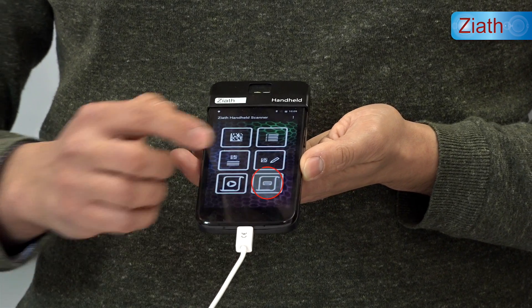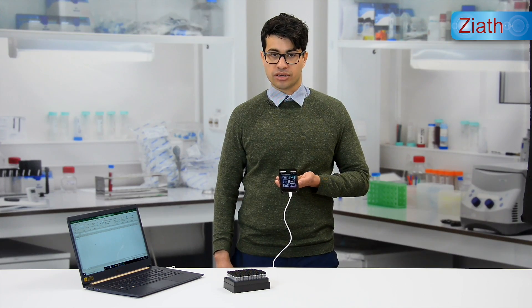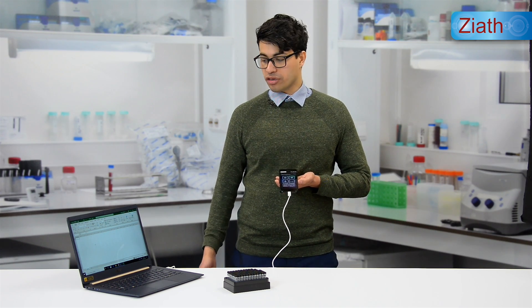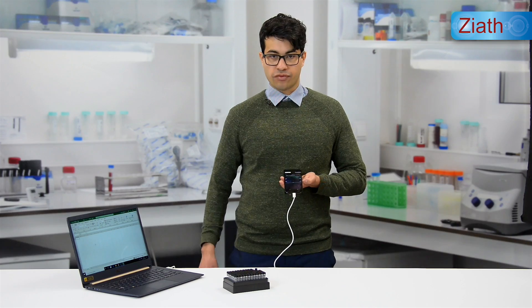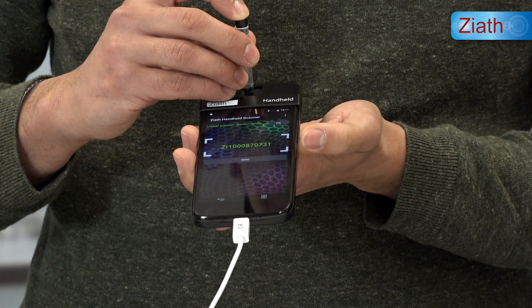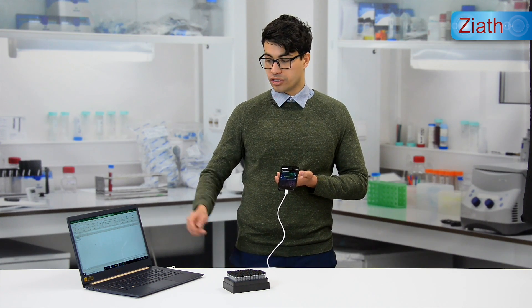For the keyboard wedge function, it will transmit a barcode onto an open on-screen application. That could be a LIM system, Excel, a Word document, a text file, and so on. If we take a tube, scan it and click send, it will put the barcode onto the open application.